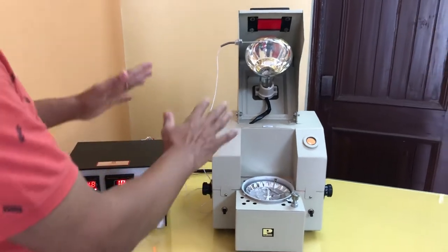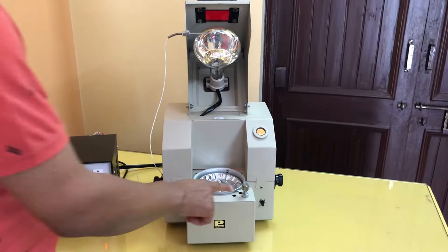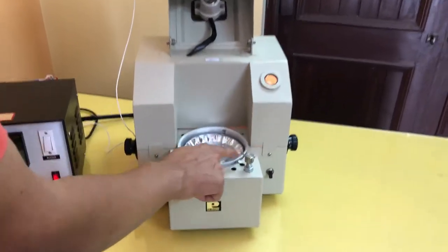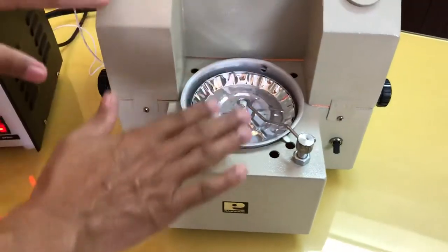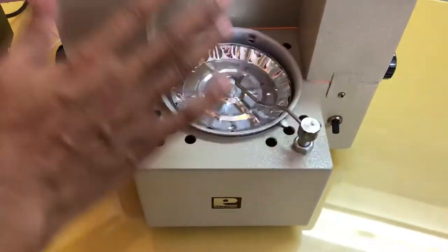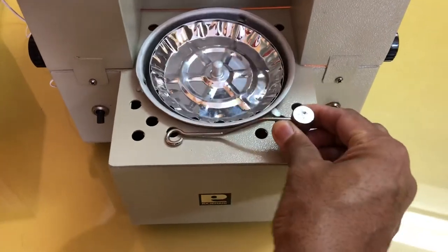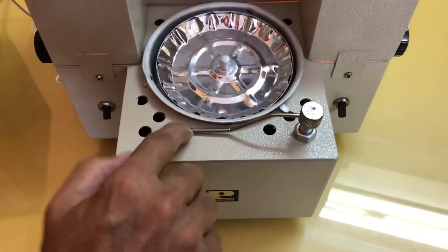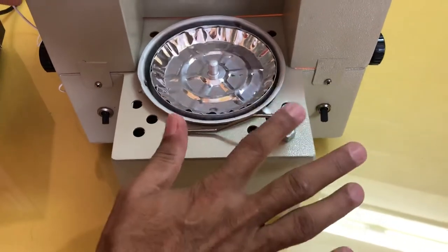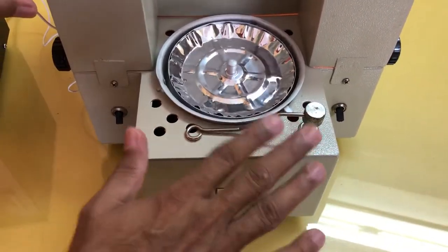Once this instrument has reached to the laboratory, first of all what we have to do is unlock it. This is a lock pin. We keep the instrument in locked condition for transportation purposes only. Once it has reached your laboratory, just pull this part and rotate it toward this side and just keep it here. Now there is no use of this lock pin — it is used only for transportation.